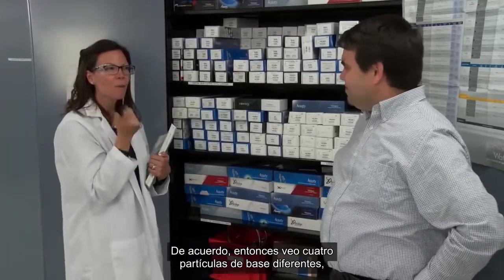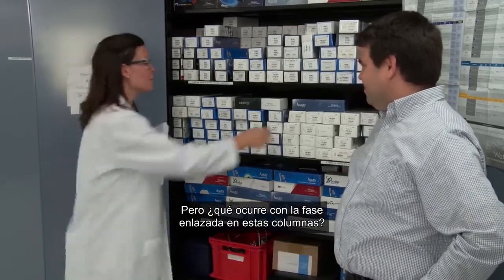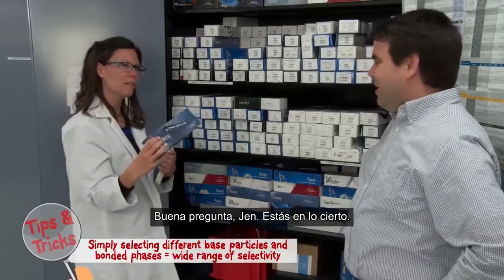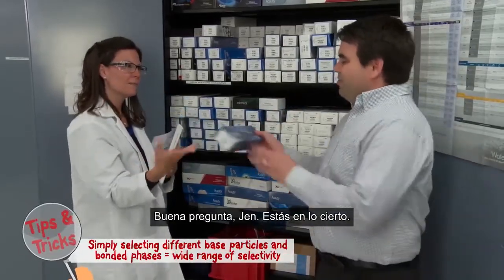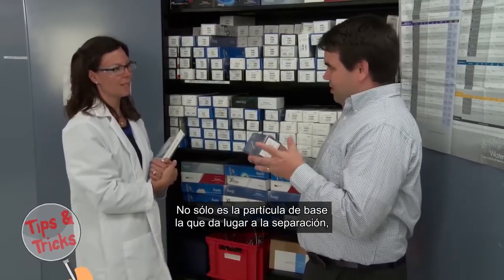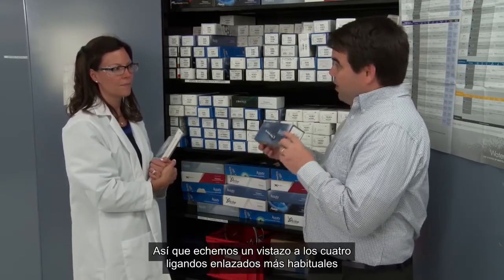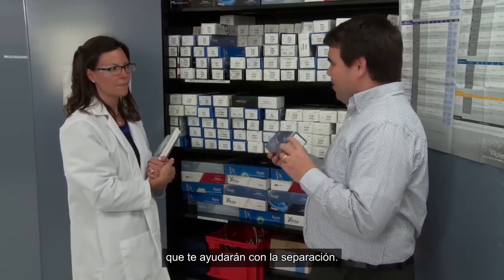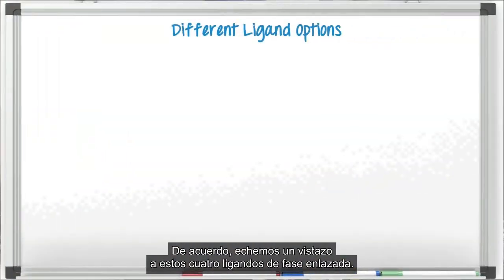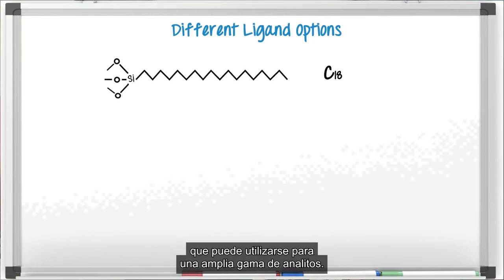Okay, so I see how 4 different base particles all have unique attributes, but what about the bonded phase in these columns? Great question, Jen. You're exactly right. Not only is it the base particle that leads to your separation, but also the bonded ligand. So let's take a look at 4 really common bonded ligands that'll help you with your separation. Great. Okay, let's take a look at these 4 bonded phase ligands. We'll start off with a C18, a general purpose ligand that can be used on a wide range of analytes.